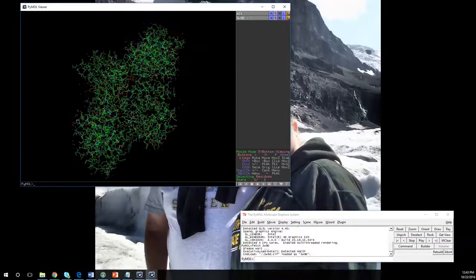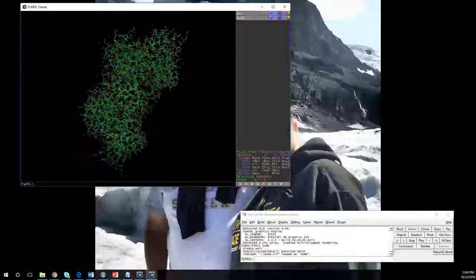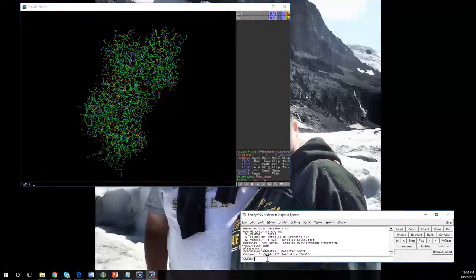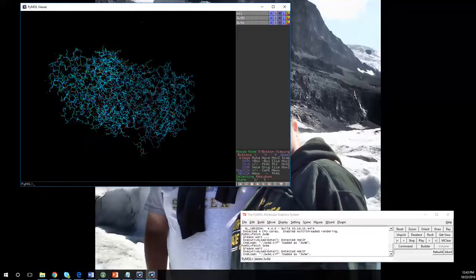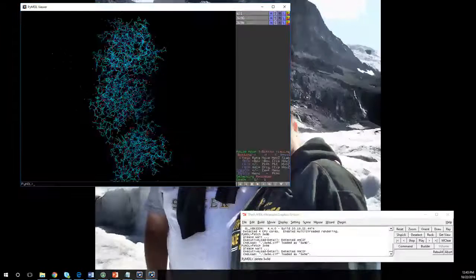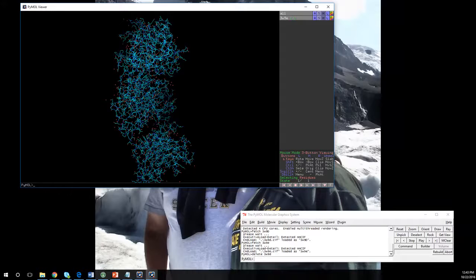So over here is how it comes across, and it's a stick figure, and it's not very nice, and I commonly very quickly, oops, I fetched the wrong one. Okay, and then since I put the wrong one in there, I can do a quick delete 3W9D. So you'll notice they're both over here. I could hide this one, and it's still in there if I wanted to, but I can also just delete it, and it'll take it away from being over there. So that's a quick way to do that.